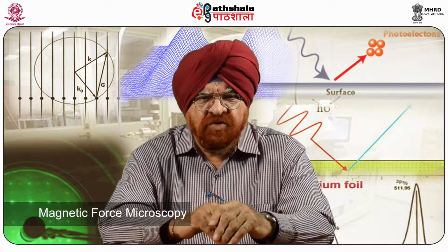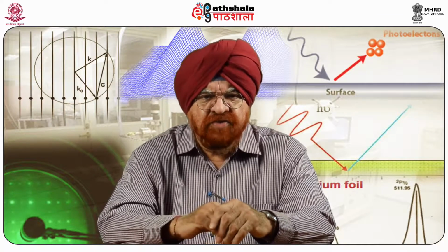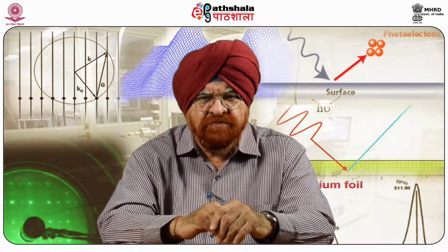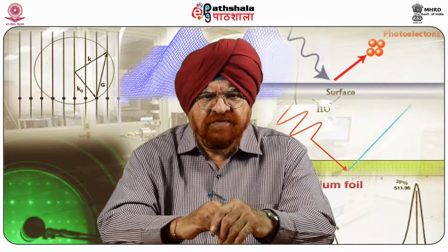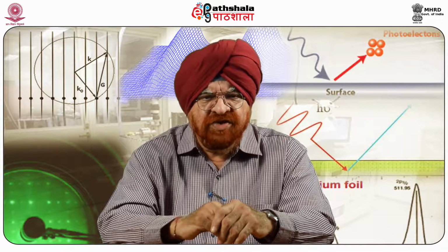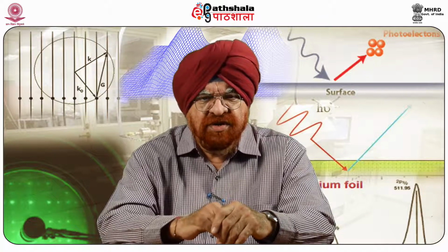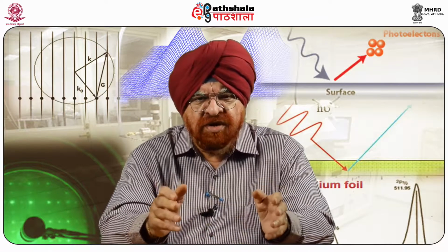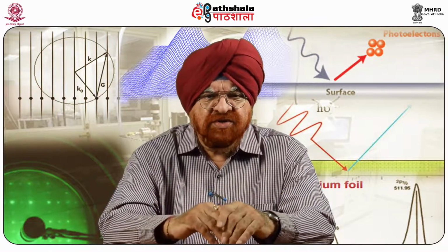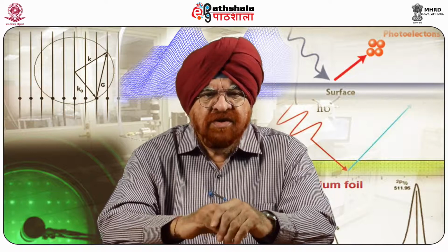Magnetic force microscopy, as stated earlier, has special probes used for MFM. They are magnetically sensitized by sputter coating with a ferromagnetic material. The cantilever is oscillated near its resonant frequency, that is about 100 kilohertz. The tip is oscillated tens to hundreds of nanometers above the surface.